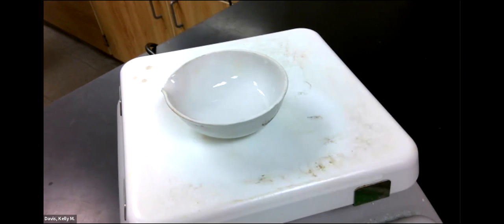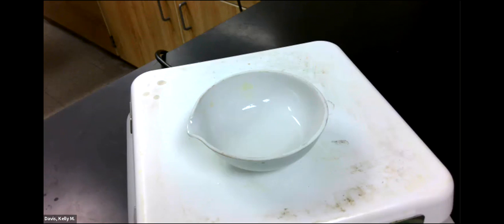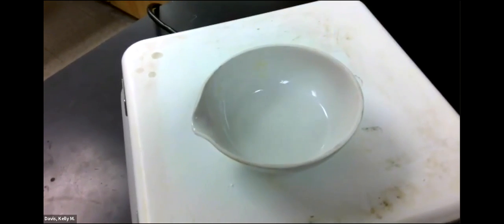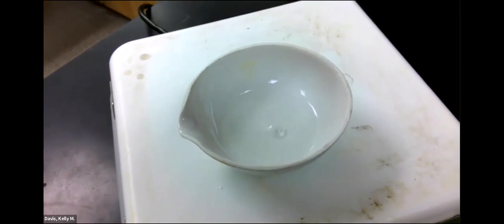All right, I'm going to pause the video and then just turn it back on when it's doing something interesting. Okay, so I've turned the video back on. You can see it starting to boil here. This took, I don't know, maybe 5 minutes or so. The water's boiling.